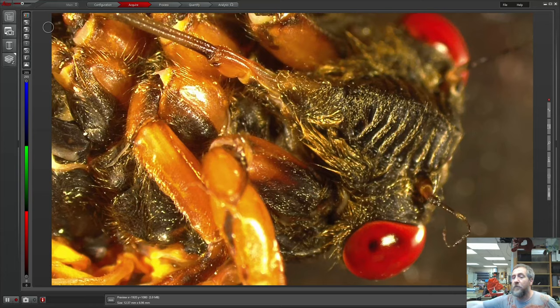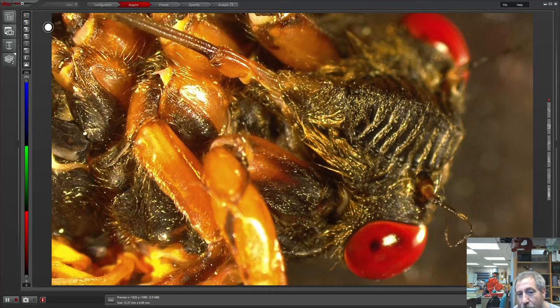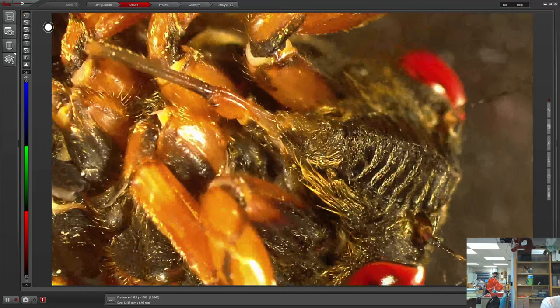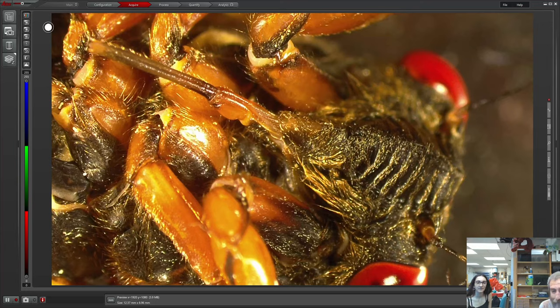Okay, just doing a short stream. Got everything set up and we're looking at some cicadas from Brood X, which is the current brood. I think there are three different species in Brood X.